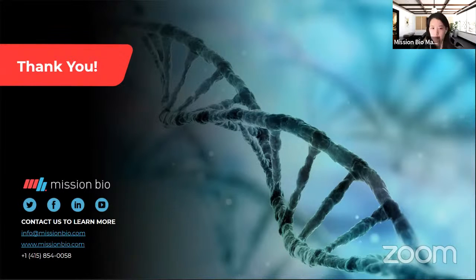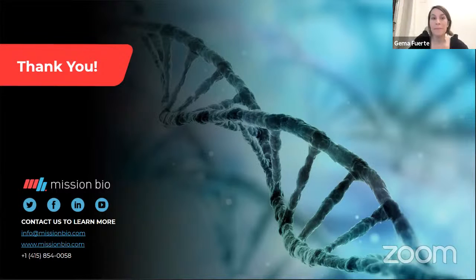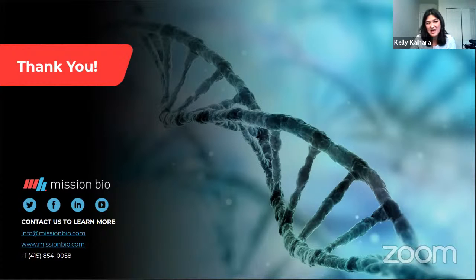Okay, a couple more questions just came in. This is also an interesting one. Does the software only support SNV mutations and protein, or does it also support ATAC-seq? You want to take that, Kelly? Sure. At this time, we do SNVs and CNVs and protein, and we don't do ATAC-seq at this point.